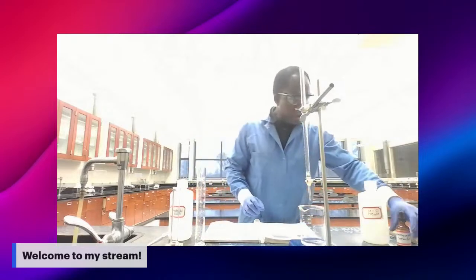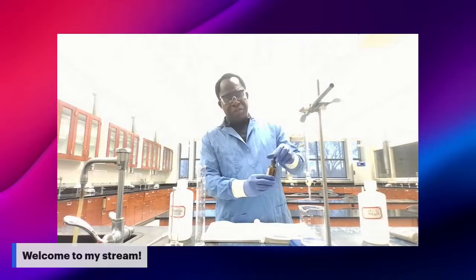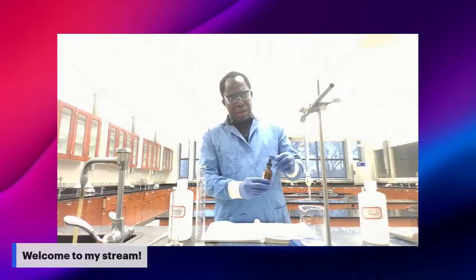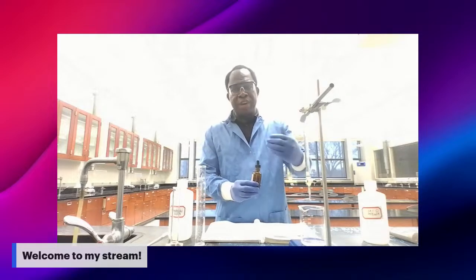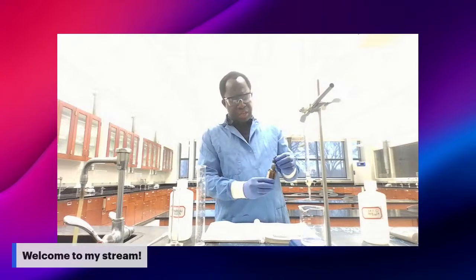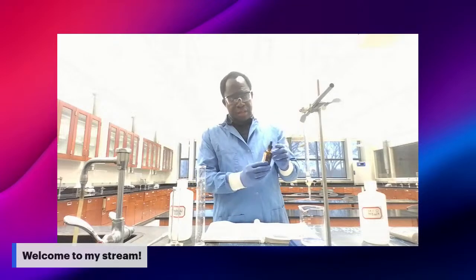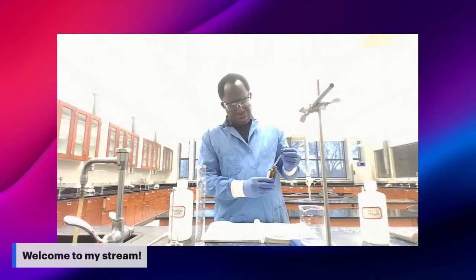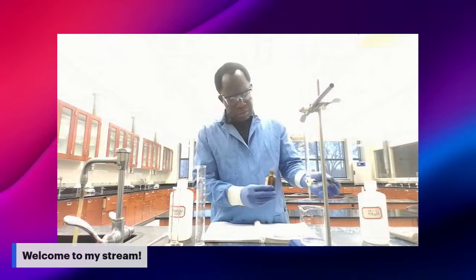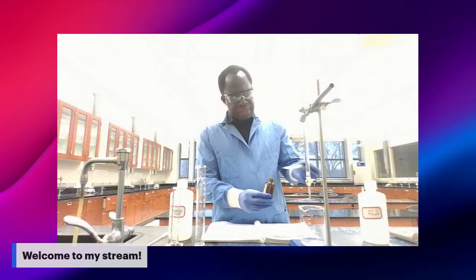But in order to know when we get to the equivalence point in this experiment, you need the phenolphthalein, which is a color indicator. So you need to add 5 drops to the acid.